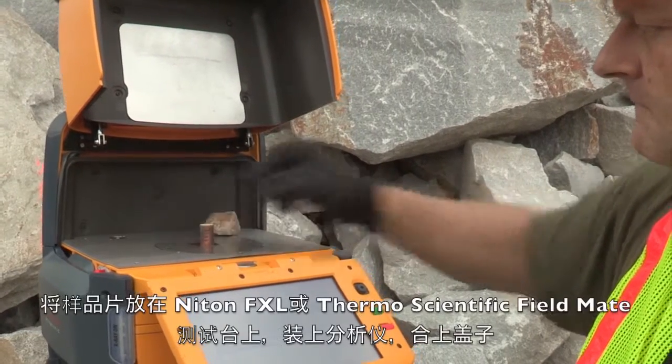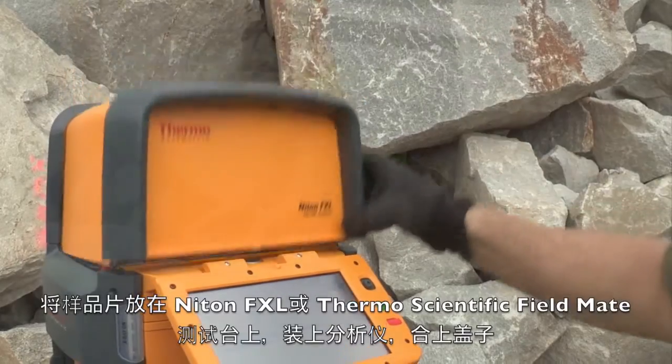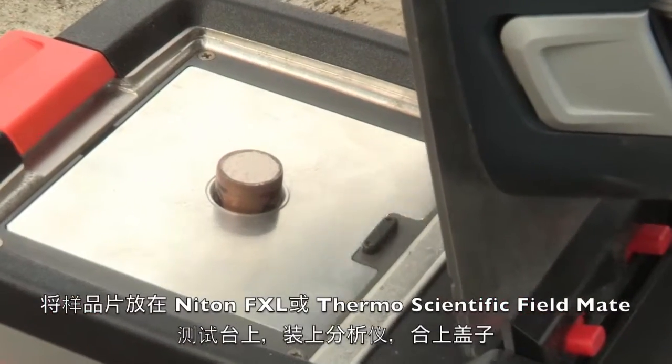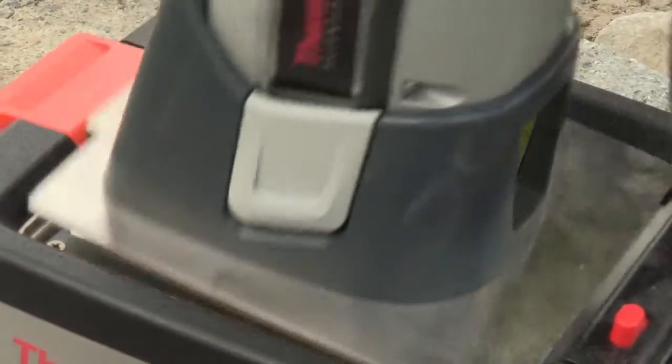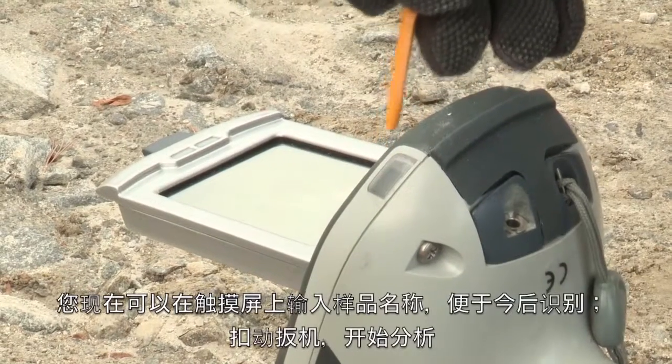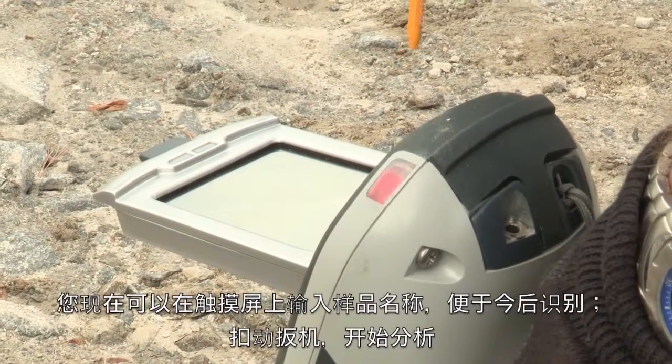Place the pellet directly on the Niton FXL or in the Thermo Scientific Field-Mate test stand, and with the analyzer installed, close the lid. You can now enter the name of the sample on the touch screen of the analyzer for later identification, and then click the trigger to begin your analysis.